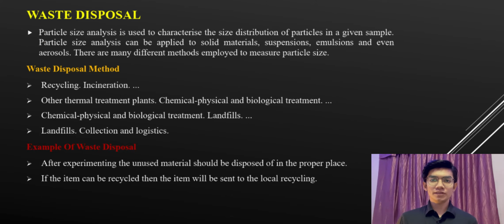Waste disposal. Particle size analysis is used to characterize the size distribution of particles in a given sample. Particle size analysis can be applied to solid materials, suspensions, emulsions, and even aerosols. There are many different methods employed to measure the particle size. For example, waste disposal methods are recycling and incineration, other thermal treatment plants, and chemical, physical, and biological treatment.